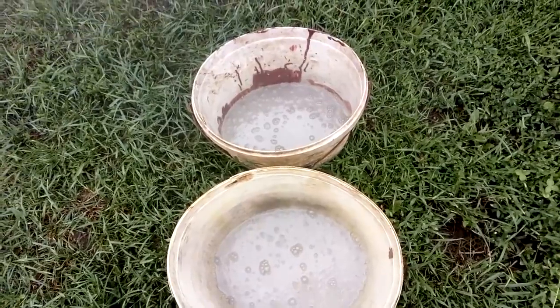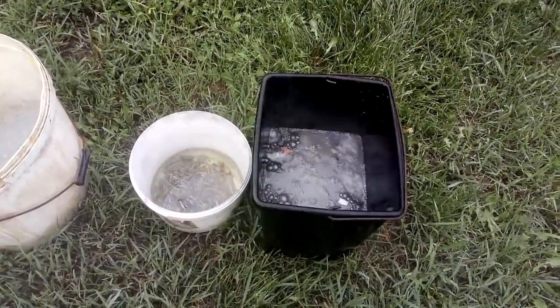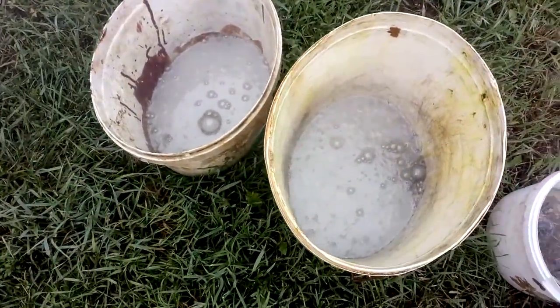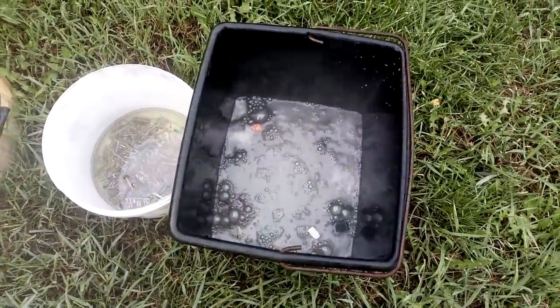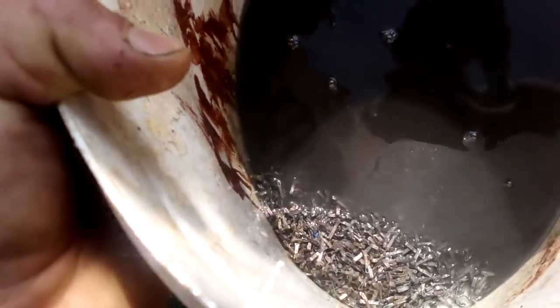Let's see what's left. HCL removed all the tin and lead. Now we're gonna wash that and add the nitric batch.